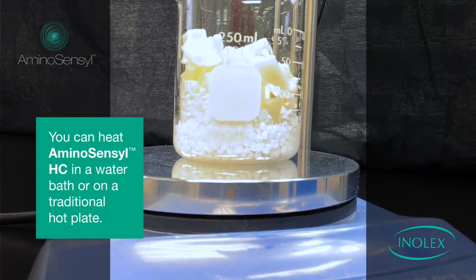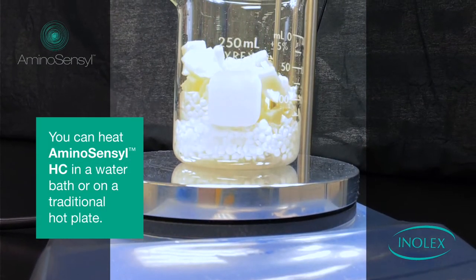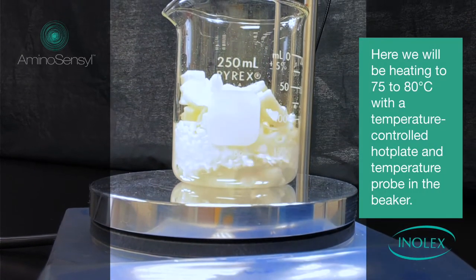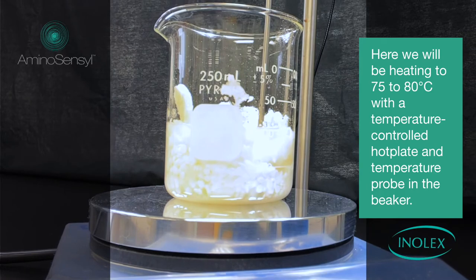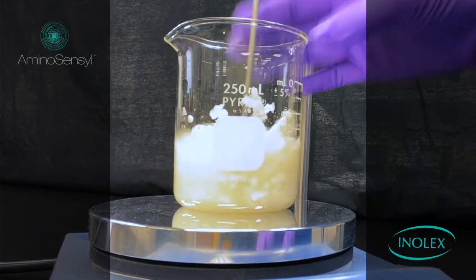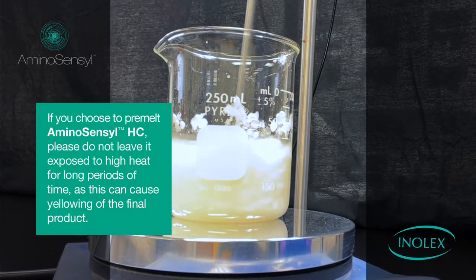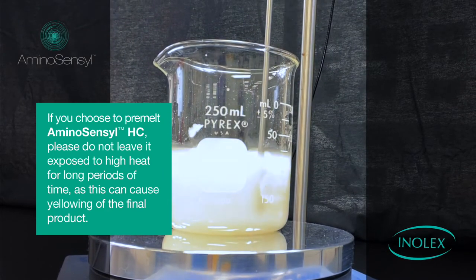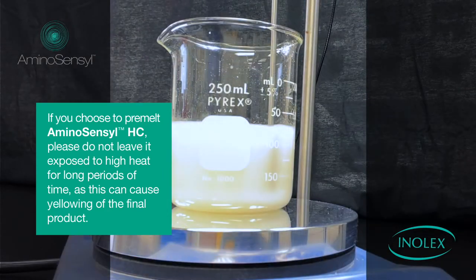You can heat Aminosensyl HC in a water bath or on a traditional hot plate. Here, we will be heating to 75 to 80 degrees Celsius with a temperature-controlled hot plate and a temperature probe in the beaker. If you choose to pre-melt Aminosensyl HC, please do not leave it exposed to high heat for long periods of time, as this can cause yellowing of the final product.